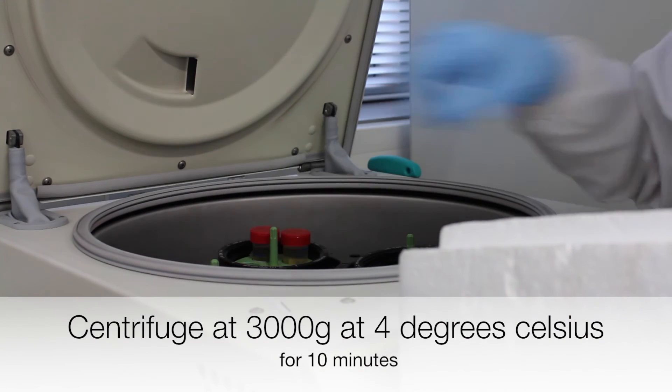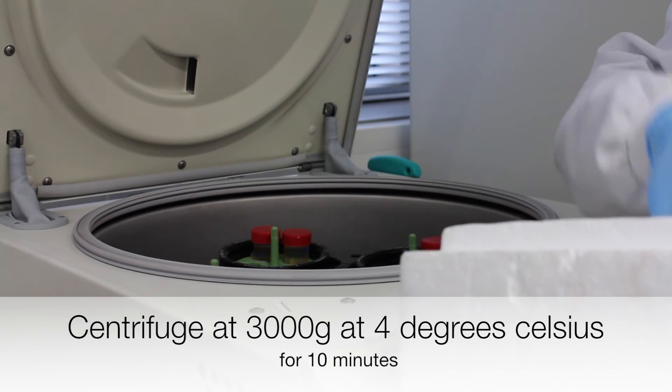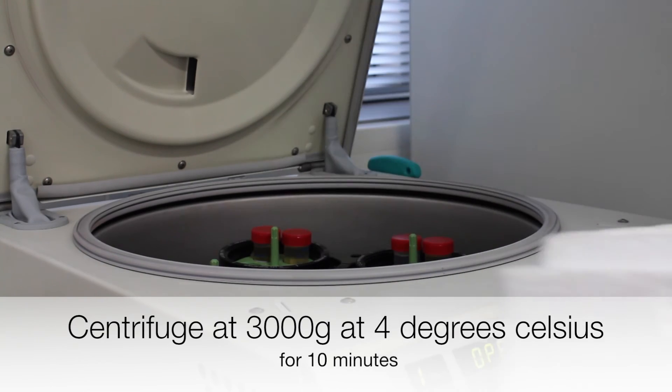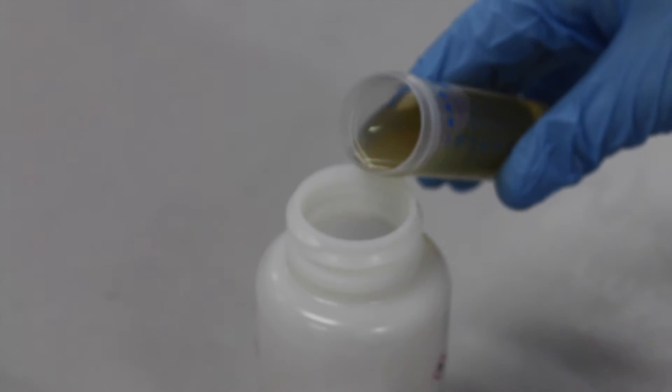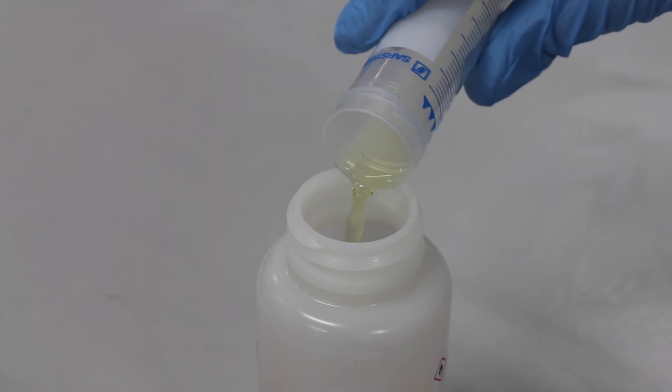The tubes are centrifuged at 3000 g at 4 degrees Celsius for 10 minutes. As much of the supernatant as possible is removed without disturbing the pellet.